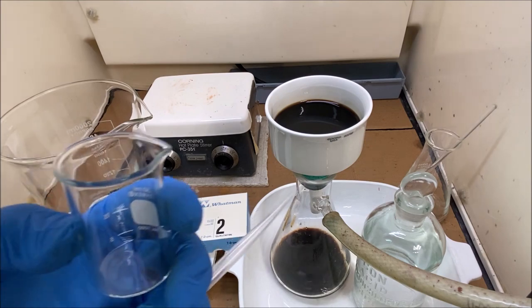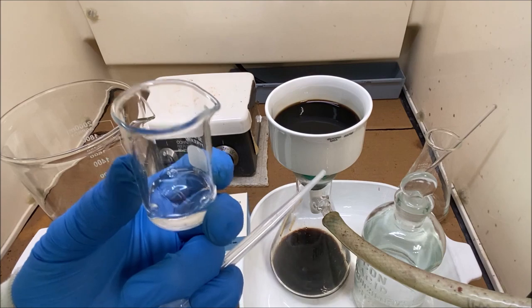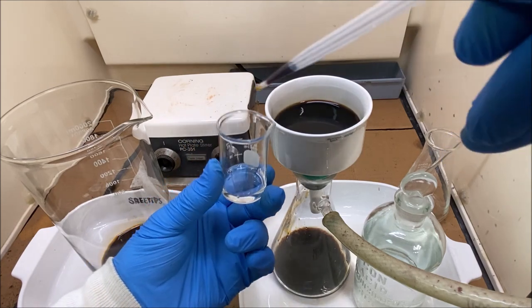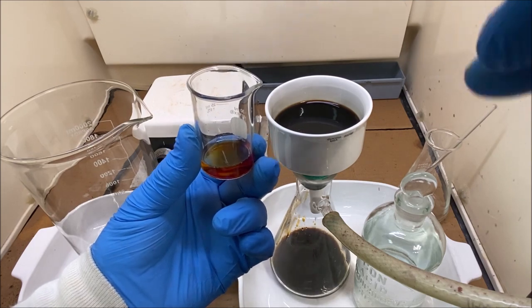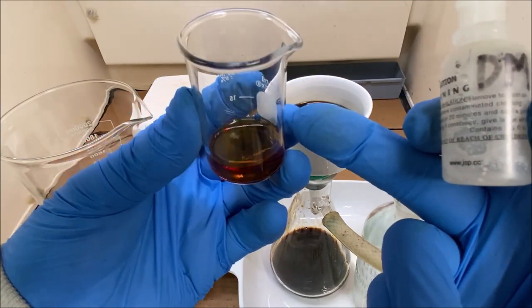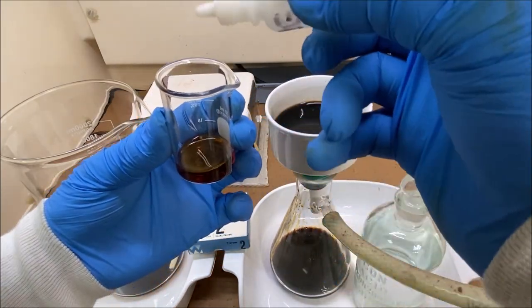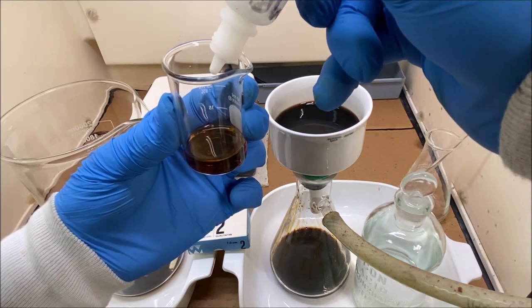While waiting for this to filter, I've got a little beaker with a few milliliters of distilled water. I'm going to draw some of this solution up and add it to the water - it sure does look like palladium to me. Here's our sample diluted with some distilled water. I've got some dimethylglyoxime in this little container. If this is palladium we should see a bright yellow precipitate.